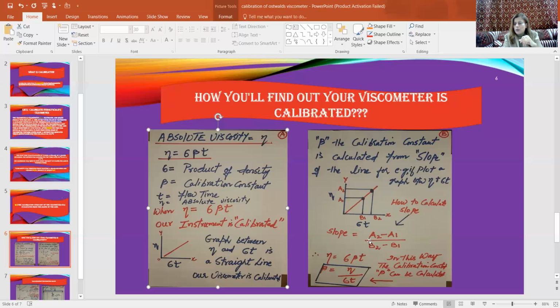You subtract the values written here, and in this way, with the help of this great equation, you are going to get the slope of your line, and you will be very happy that you calculated the slope of the line. You can do it manually also. If you have some points and some measurements over here, you can easily do the plus minus and then divide them, and you are going to get the slope of this line.